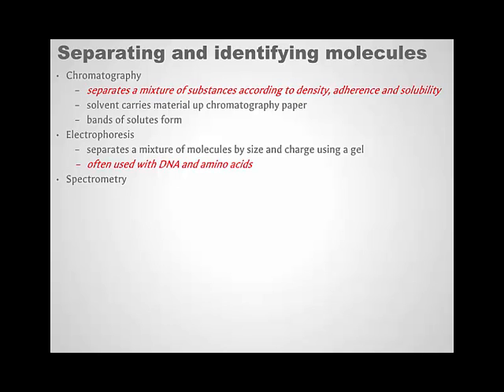So, as I was explaining, with electrophoresis, you have a gel. You put DNA samples in various parts of the gel. You then add electricity, and because DNA is a charged molecule, the DNA molecules start to move through this gel. The distance that they move depends on the size of the DNA fragments, and it creates a series of bands that you can then look at to analyze.